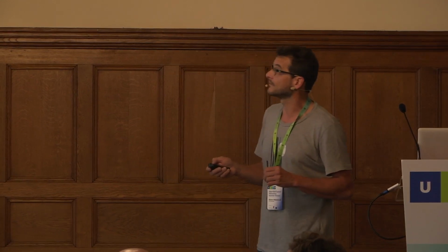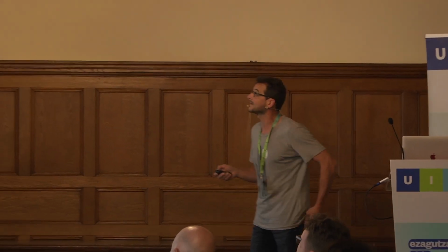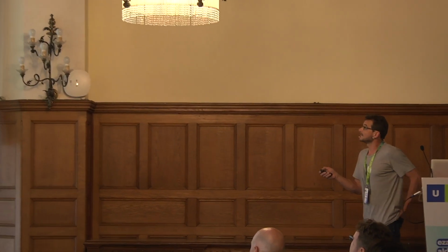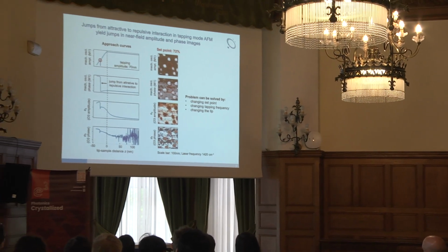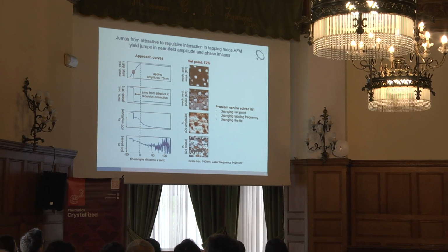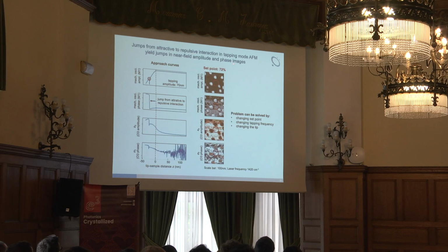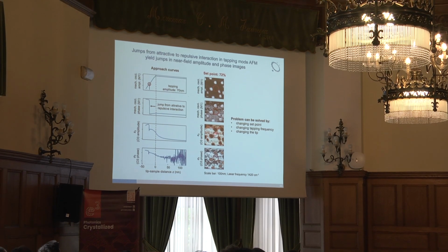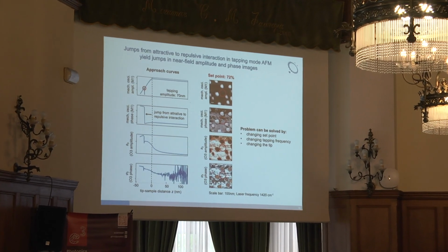Okay. All right, so let's start with the first topic, which is called influence of AFM mechanics. That was actually related to Tobias' answer. So here now you see the full set of images. I used a set point of 72%. Not me, Oshania, who's sitting here, did this experiment, if I remember correctly. So we have the topography, the mechanical phase image, the optical amplitude, third harmonic, and the optical phase image, okay?